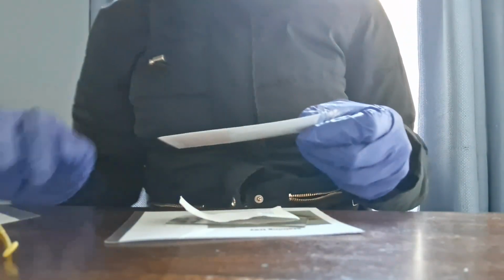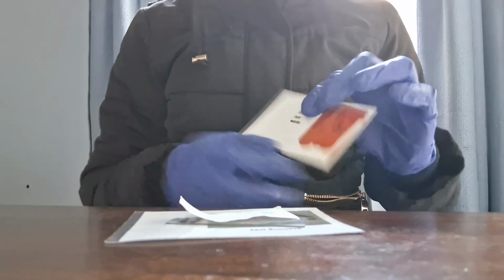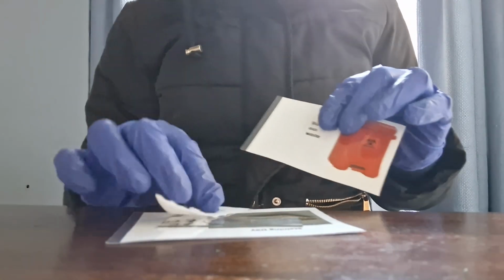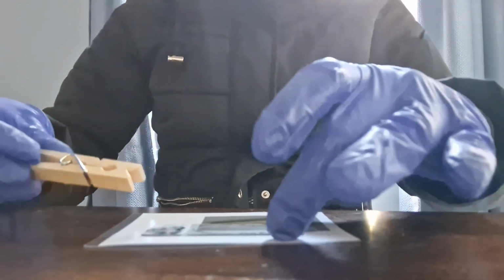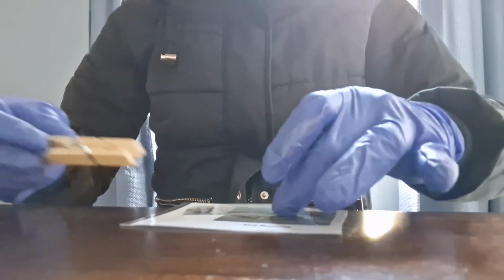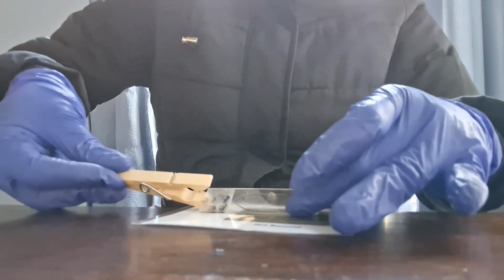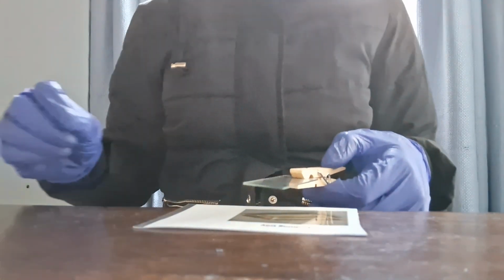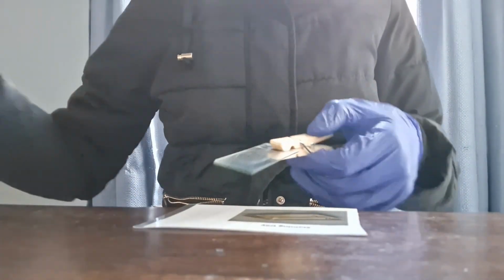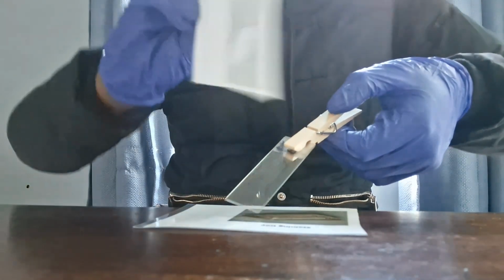After we let it cool, we can remove the blotting paper and put it in the biohazardous waste. Once the paper is removed, we put the slide on the staining tray. Then we use the water bottle on it.